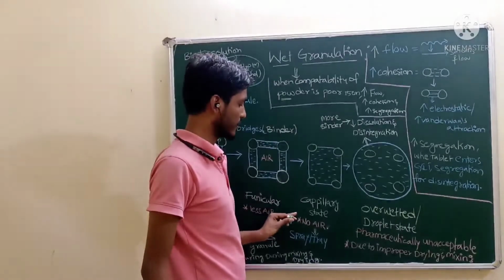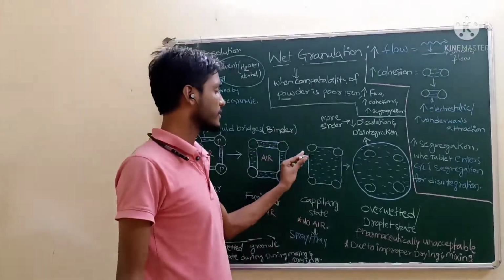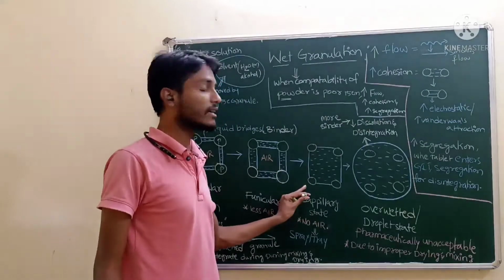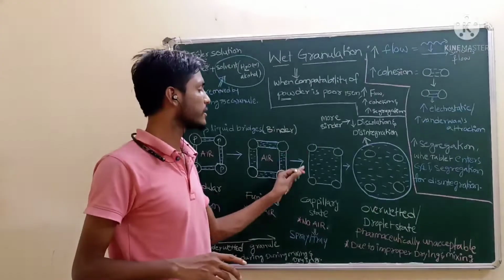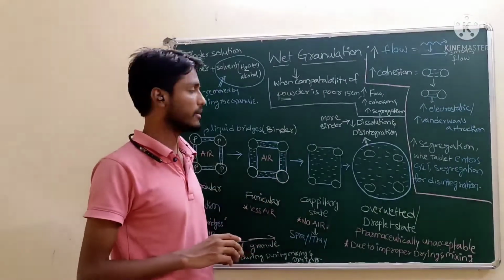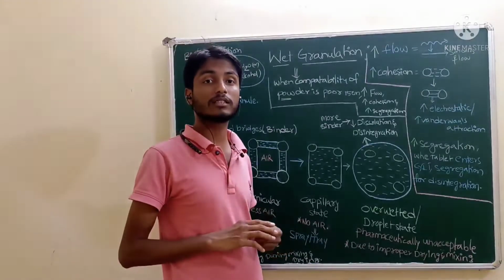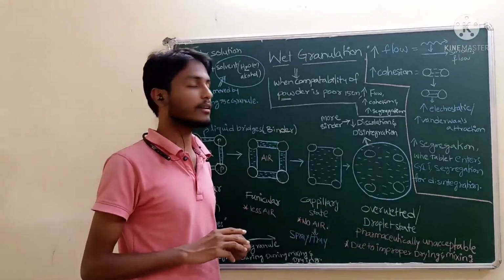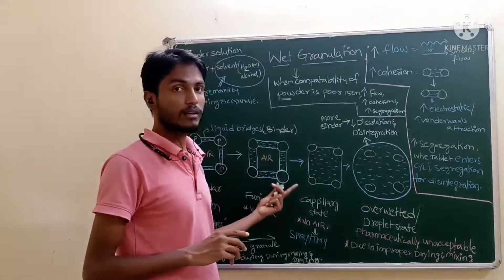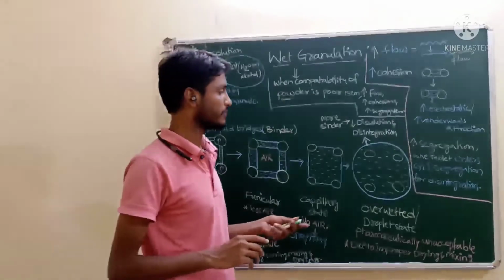Next, the capillary state. No air at all is present in the capillary state. This is our desired state in order to formulate the tablet. If air is present, it causes capping and entrapment of air, and different properties. It will also affect the tablet strength.